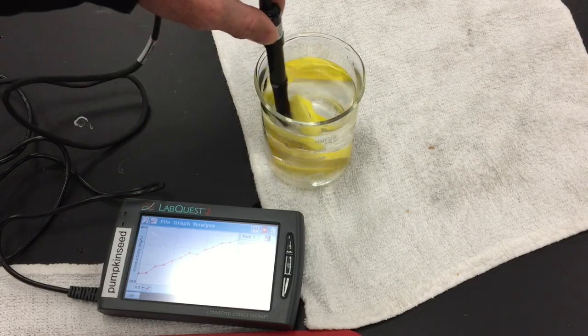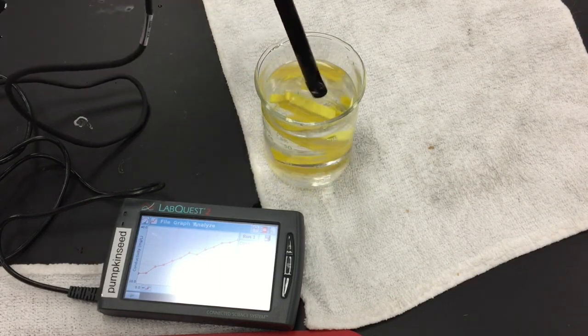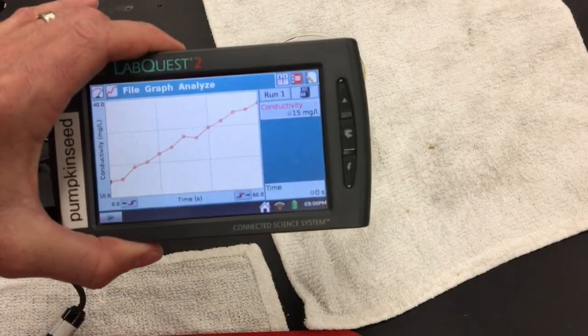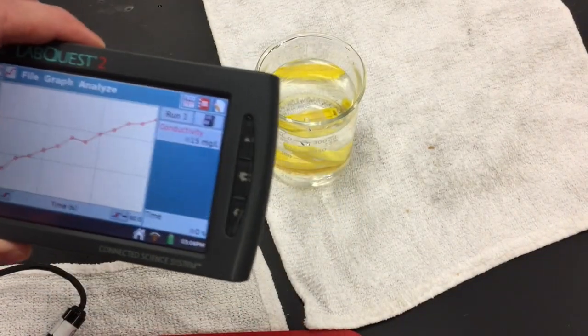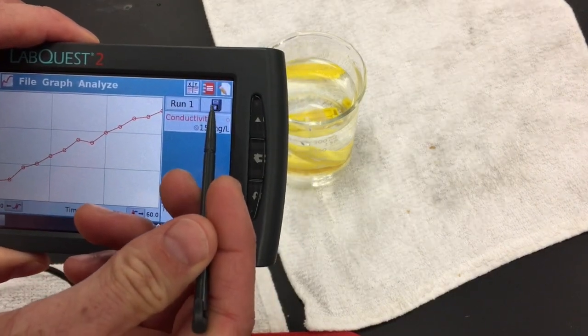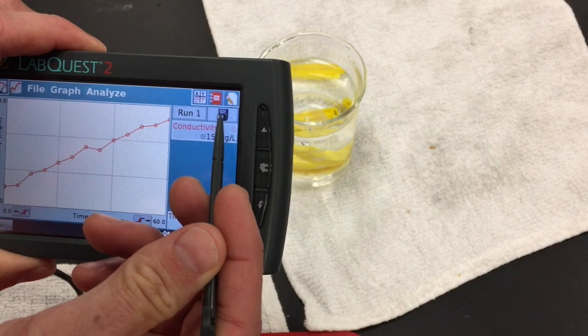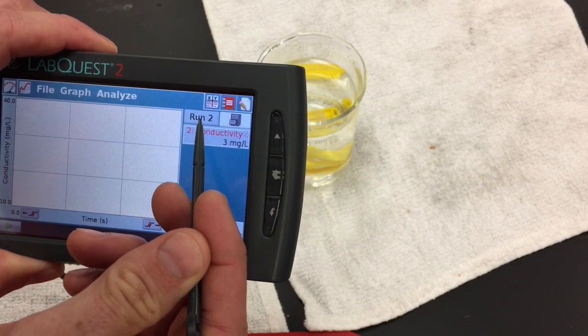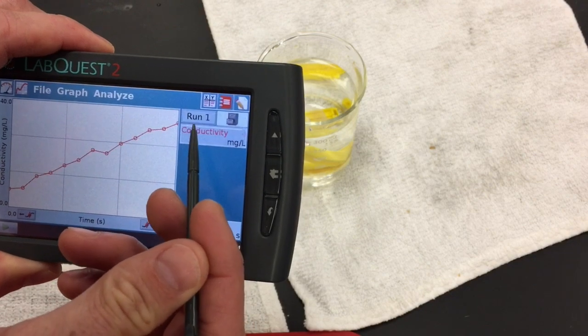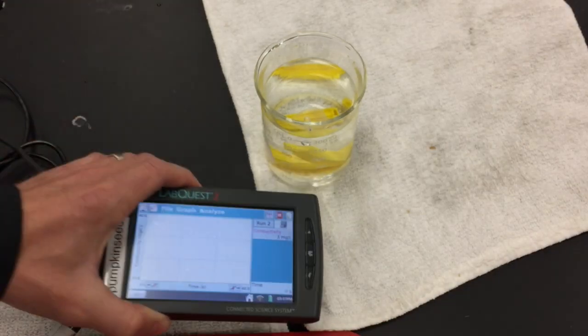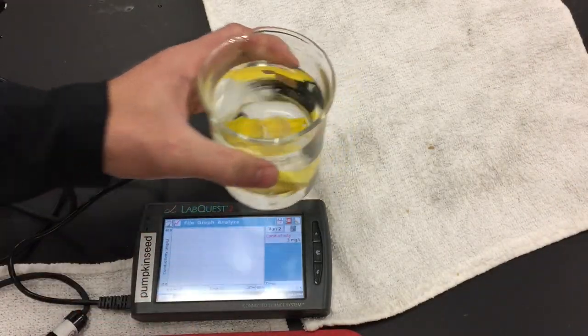When the minute of data collection is up, you can remove the conductivity meter. It should have a nice graph on there. On the graph, click this icon that looks like an old fashioned file cabinet. Now it's going to say Run 2. You can always go back and see Run 1, but you're going to want to be on Run 2 now. You need to set that up, so go back to the sink.